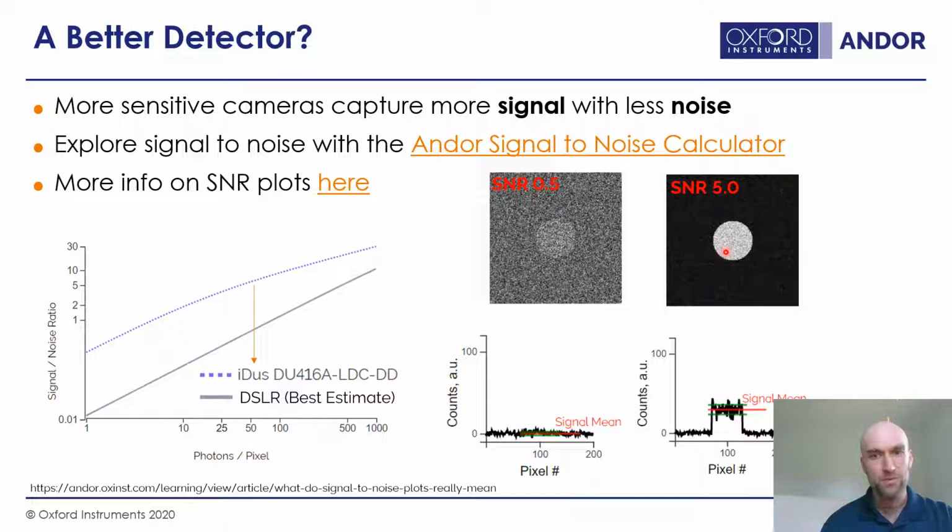So we're taking a roundabout view through some equipment choices here, through how these setups are made, just trying to create some, what's the word, sense of scale for different performance and what you need to record these beautiful spectra that you see in these references that I show, these papers that I show.